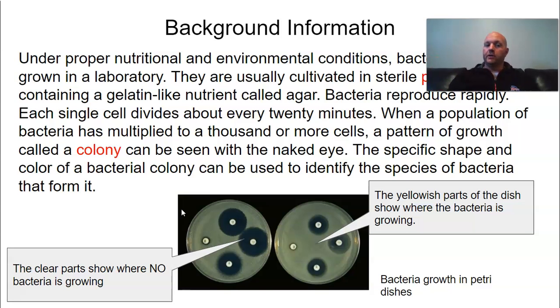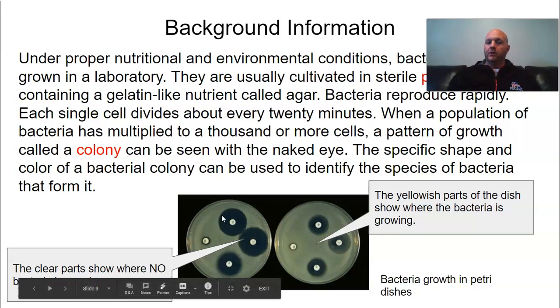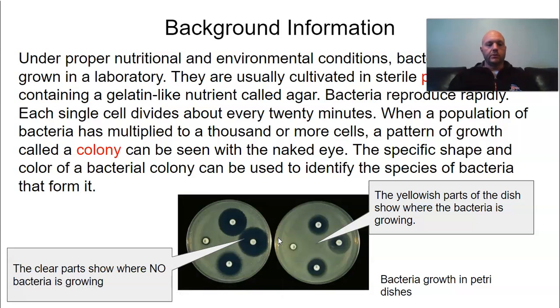So what are you measuring? Hint, this thing right here, and then that's the dependent variable. The independent variable is probably also something to do with these discs, specifically what's on them, just in case you're wondering.